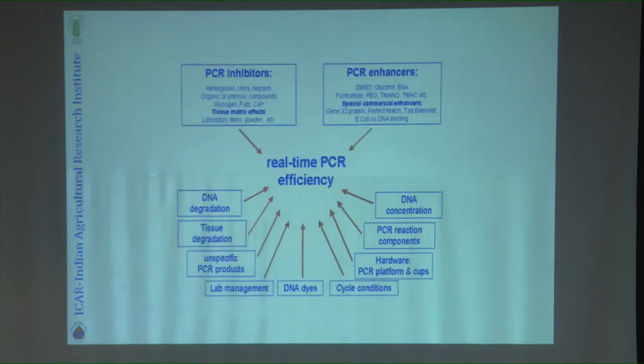So PCR application, like qPCR, is also so much. You can apply them in different conditions depending on the requirement which you have. And when I talk about real-time PCR efficiency, which is very, very important, don't ignore the aspect, because you can't leave it with the machine to take care of everything, because the PCR machine will not do many things. What you introduce is what they are going to do.